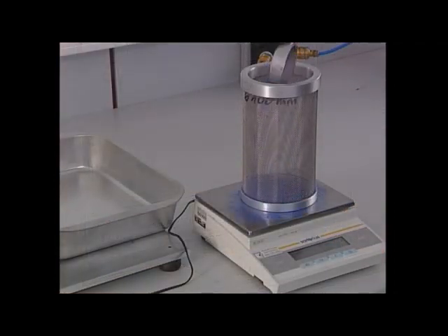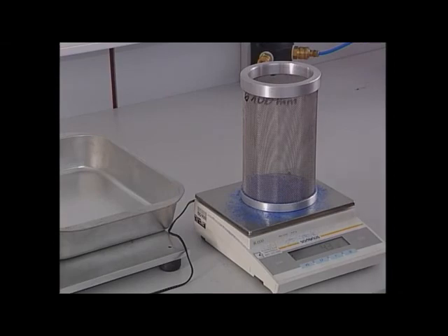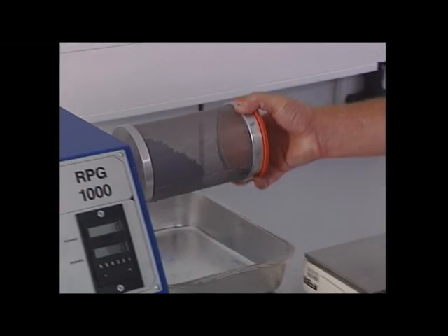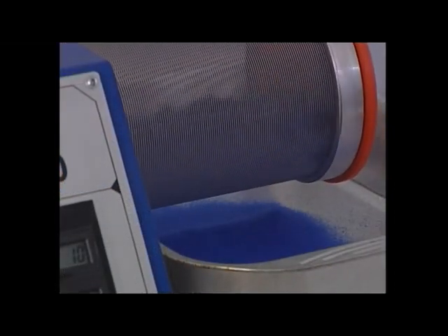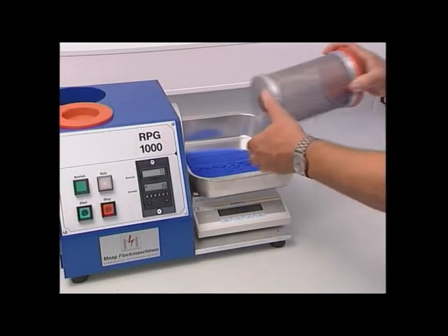For siftability control, 20 grams of Flock are weighed and placed in the siftability testing equipment, where the flow of the Flock fibers through the sieve is measured. Any Flock remaining in the sieve drum after 60 turns should not exceed a maximum weight and should be free of overlengths and balling.